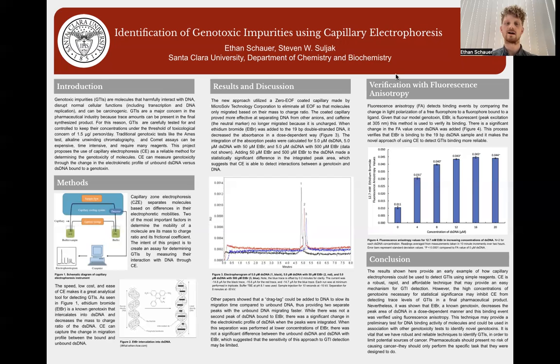The results shown from my research in Figure 3 depict a dose-dependent decrease in the absorbance of double-stranded DNA as the concentration of ethidium bromide increased. Peak 1, the black line, has only DNA. Peaks 2 and 3, which are red and blue, have the same concentration of DNA as peak 1, but they have an increasing amount of ethidium bromide.